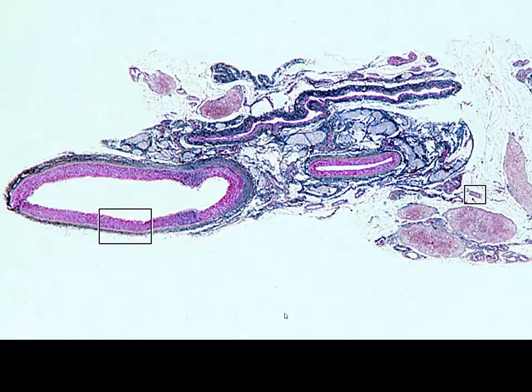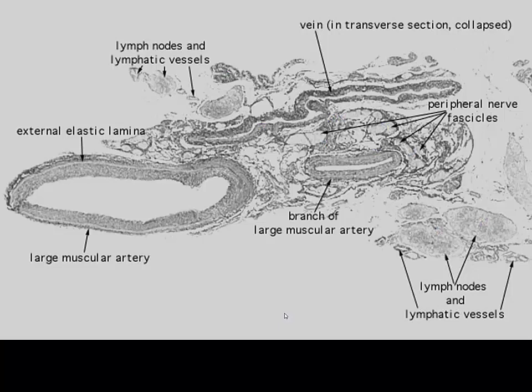All right, just a few more examples, and once again, this is what you have to do as you look at histological slides. You have to find as many different examples of muscular arteries, veins, elastic arteries, arterioles, capillaries, as many as you can, so you get comfortable with the structures and the associations of where one is versus another. The color's going to be different. The stains can be different. The shapes are going to be different. So you have to be able to use differential diagnoses, much like you will in medical school, to identify and classify these different structures that we're now moving into with our organ histology.